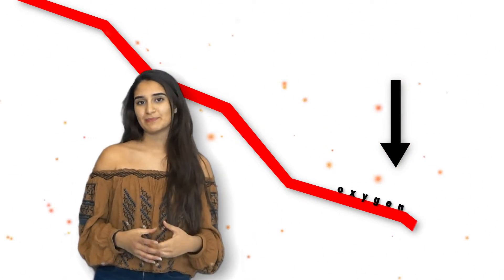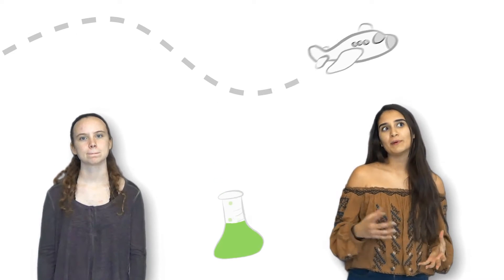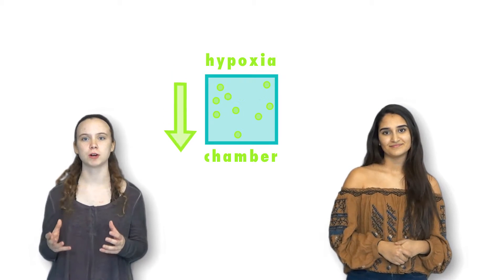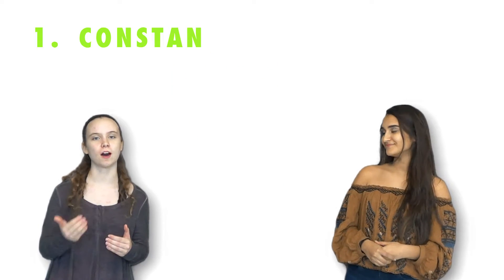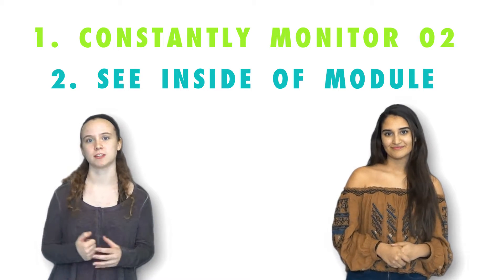Inducing hypoxia is when you lower the concentration of oxygen in the air. Conducting experiments about what happens to an object or specimen under induced hypoxia is applicable to all kinds of research projects, from those revolving around aeronautics to more biology-oriented ones. This video will go over how you can create your own self-contained module in which you can monitor the oxygen concentrations within in real time, as well as be able to see the experiment taking place.